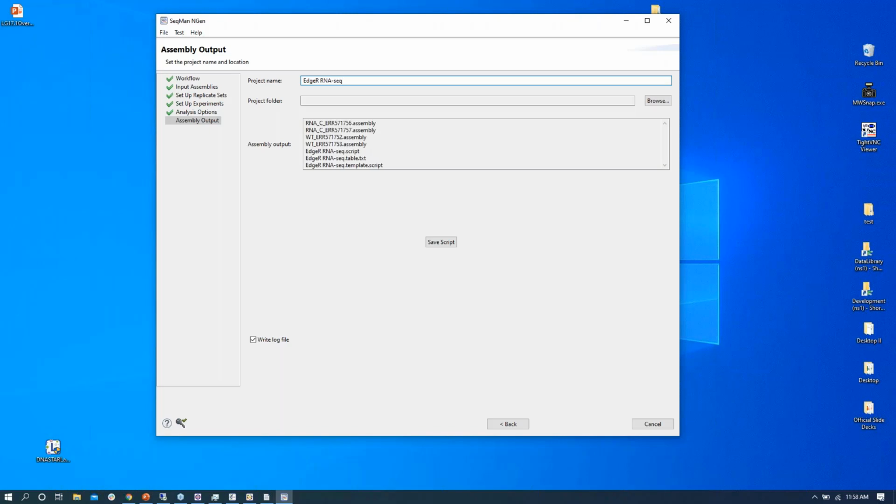And what it's going to do is take those assemblies and just recompute the gene expression values, without having to reassemble them. With E. coli, it doesn't make that big of a difference. The assemblies themselves only take a few minutes, but for some RNA-seq, if you have a 20 sample RNA-seq, it could take an hour or more for each sample. So that's a full day of assembly you can save yourself by doing this. It's a nice feature for users who are already generating data.